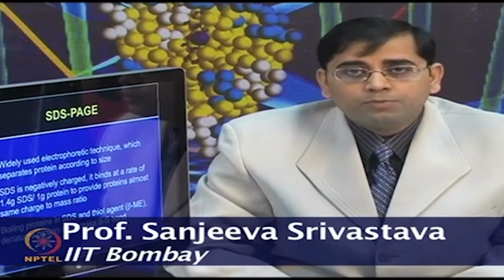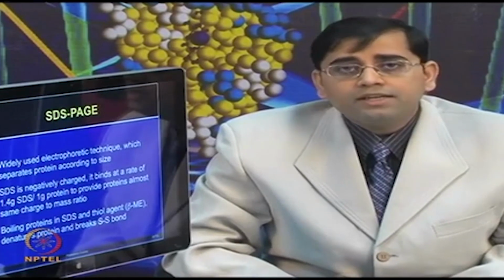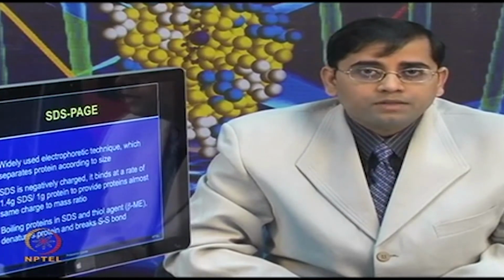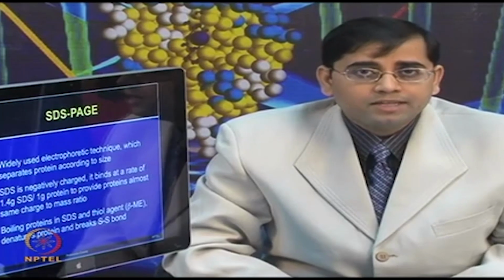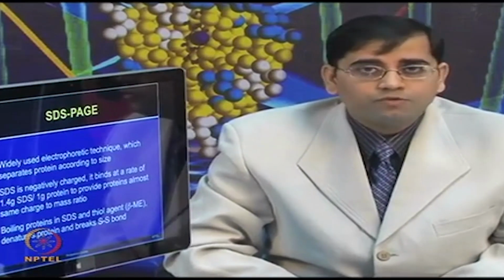As I mentioned, there are steps required to prepare your protein for denaturation. So, you need to boil your proteins in SDS and beta mercaptoethanol and DTT to denature the protein and to remove or break any disulfide bonds. Now, you cannot do this boiling step in your two-dimensional electrophoresis, where you have already focused the IPG strip in the first dimension. So, you need to do the equilibration step. The rest of the steps will be very uniform.